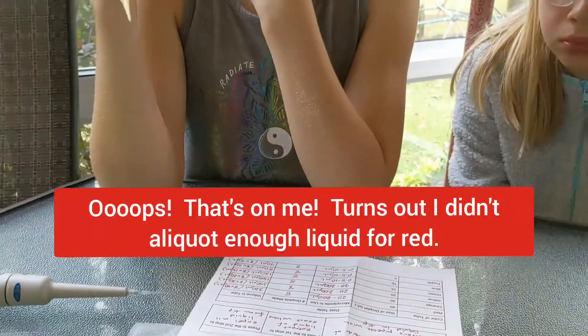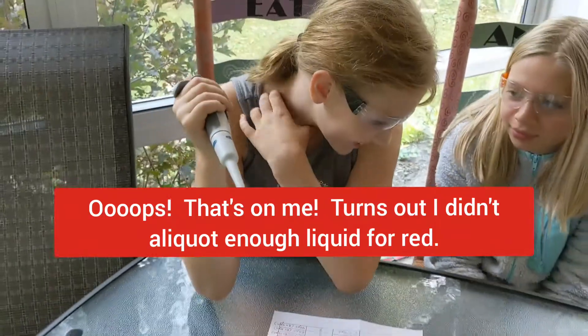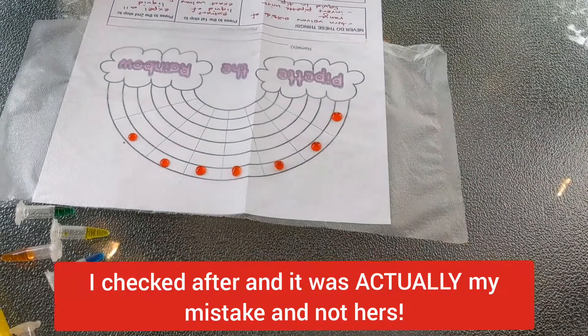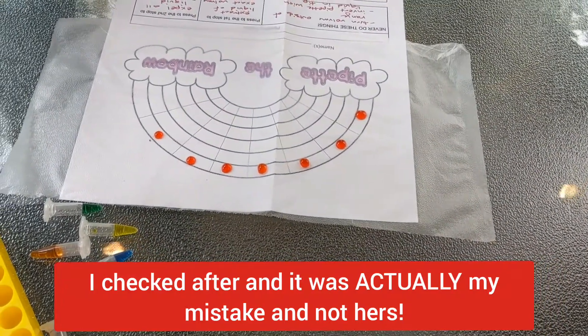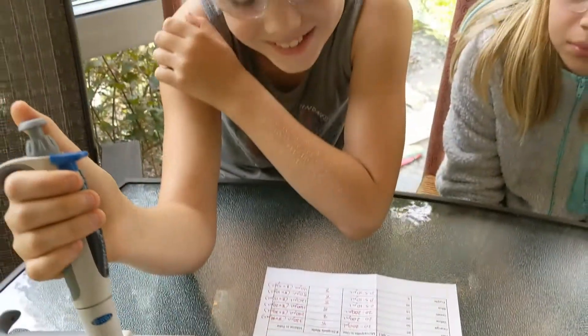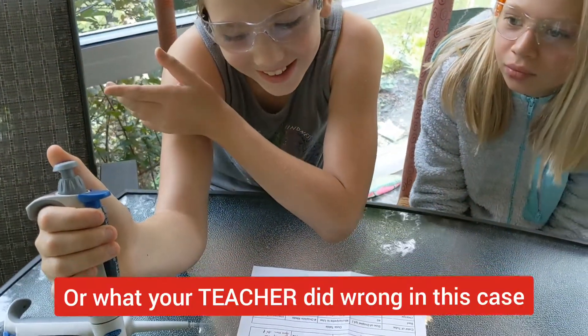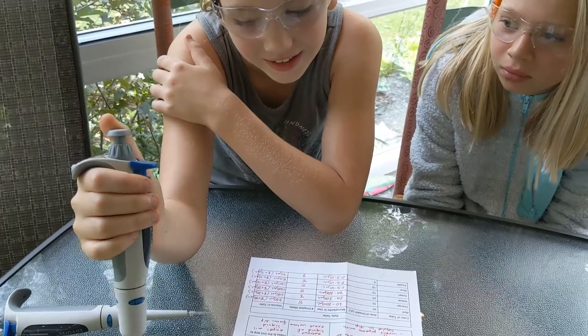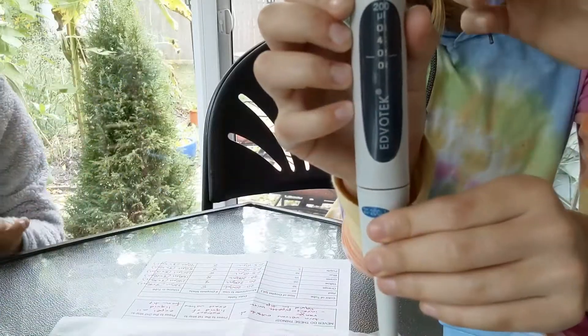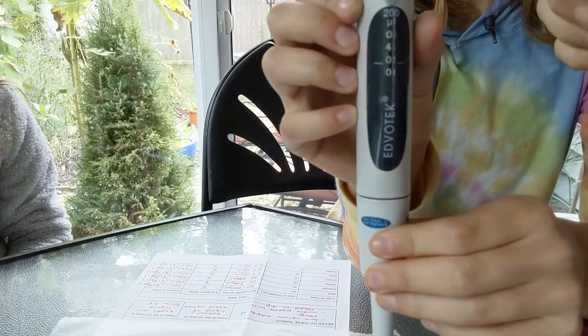Lily used too much — she ran out. If you run out, you don't want to start moving liquid from droplet to droplet. Check with your teacher to see what you're doing wrong with your pipetting. We'll try again, but let's move on to orange for now and change the pipette to 30 by twisting the knob until it reads 30.0.